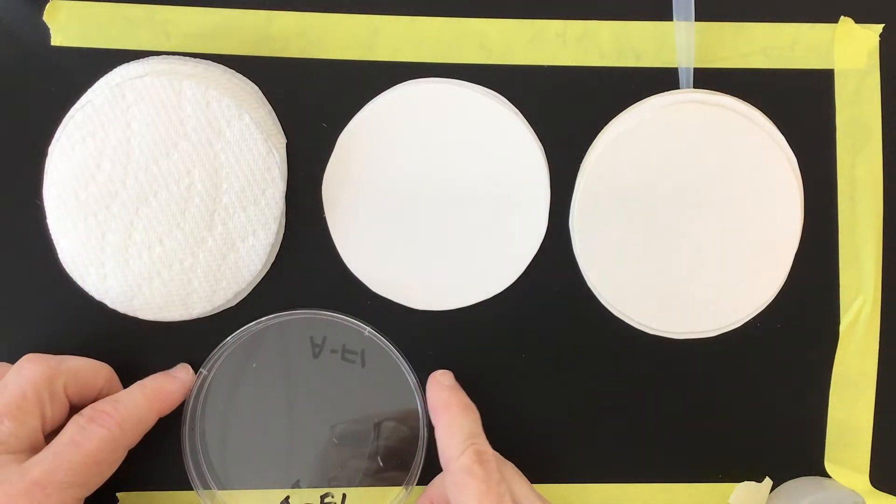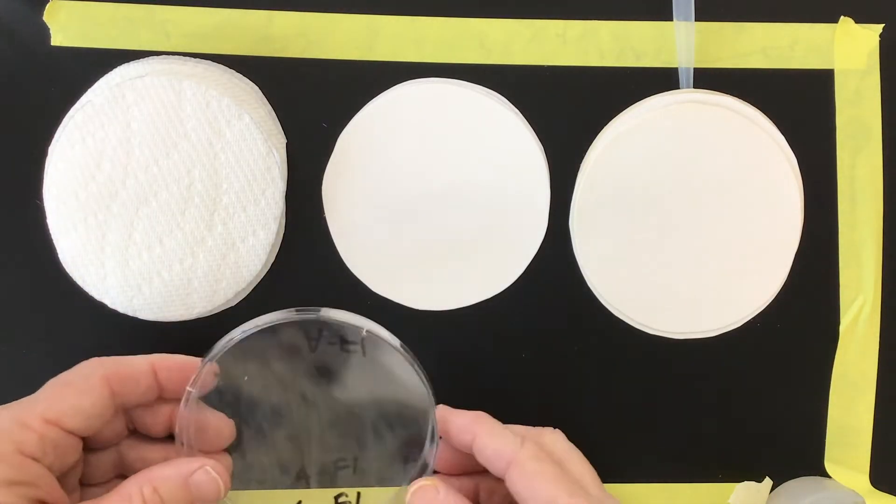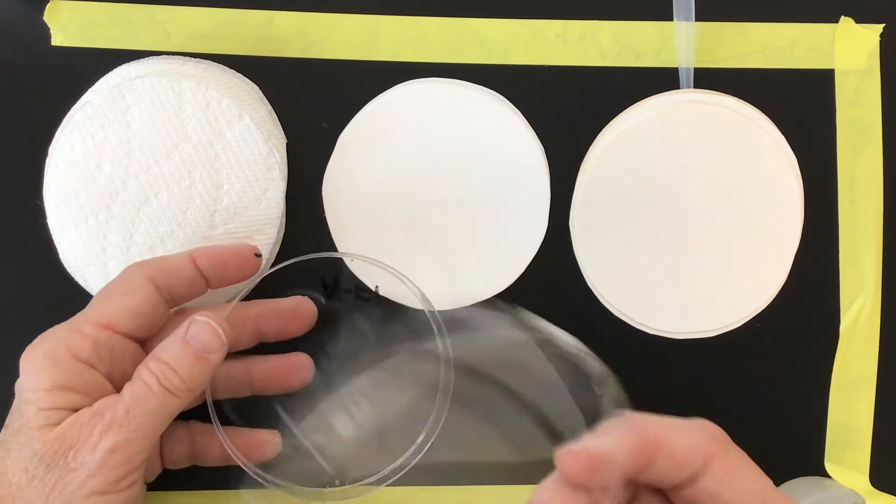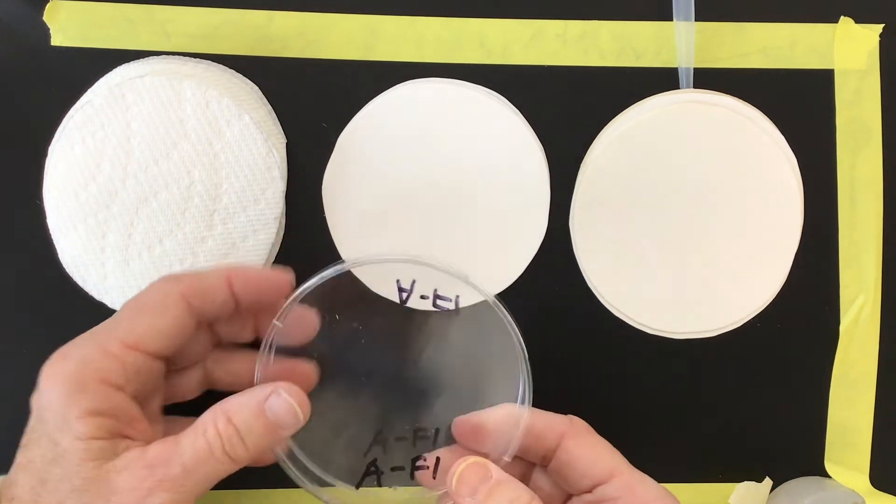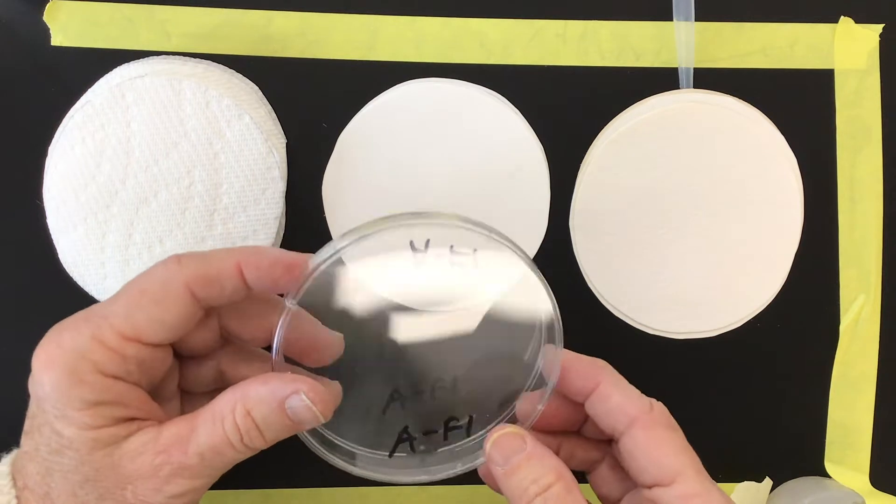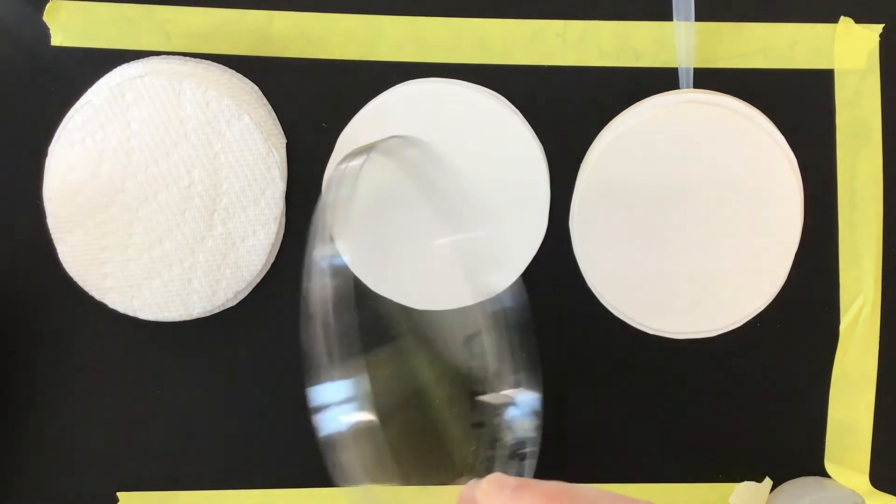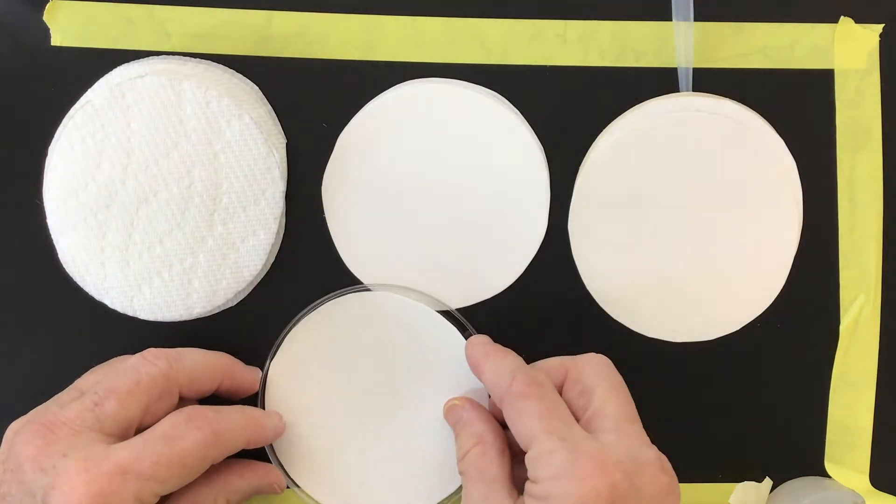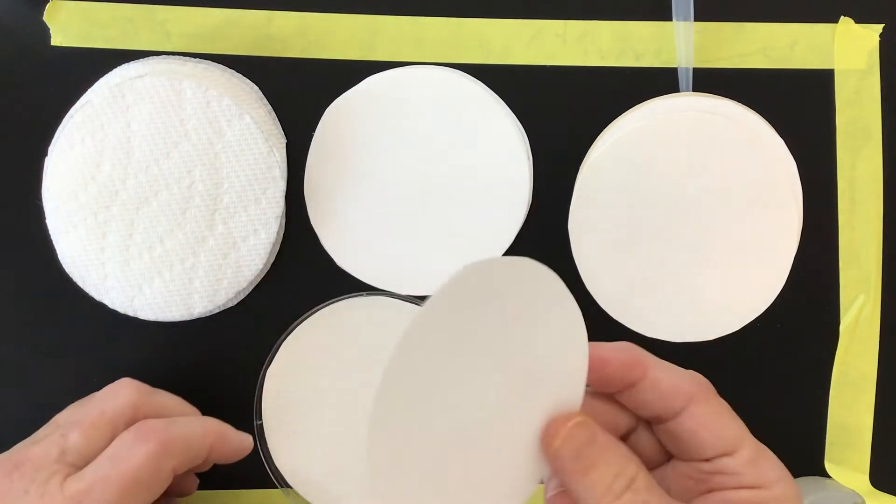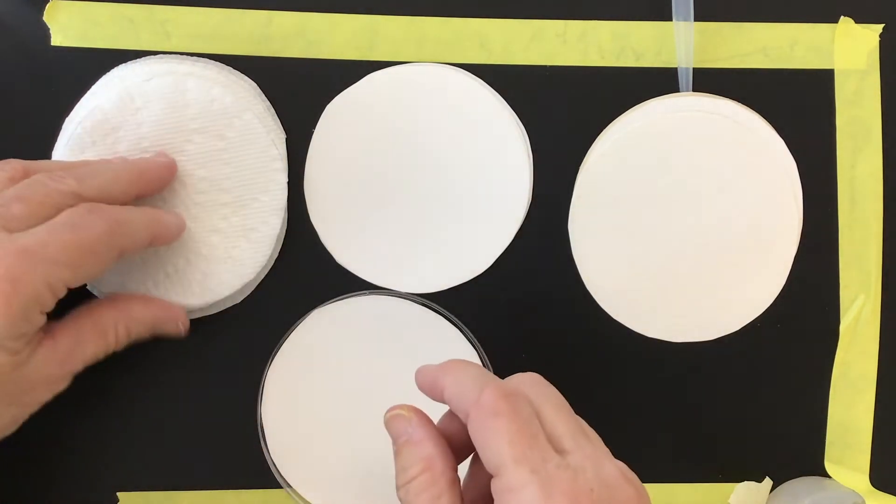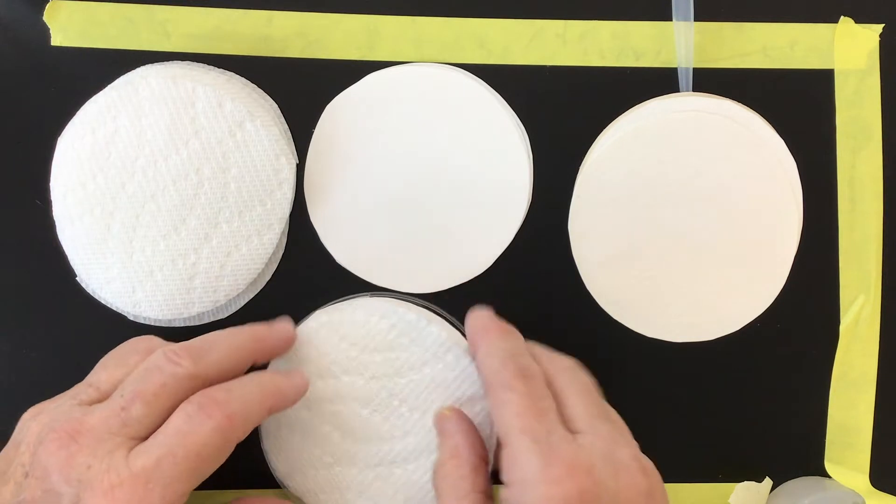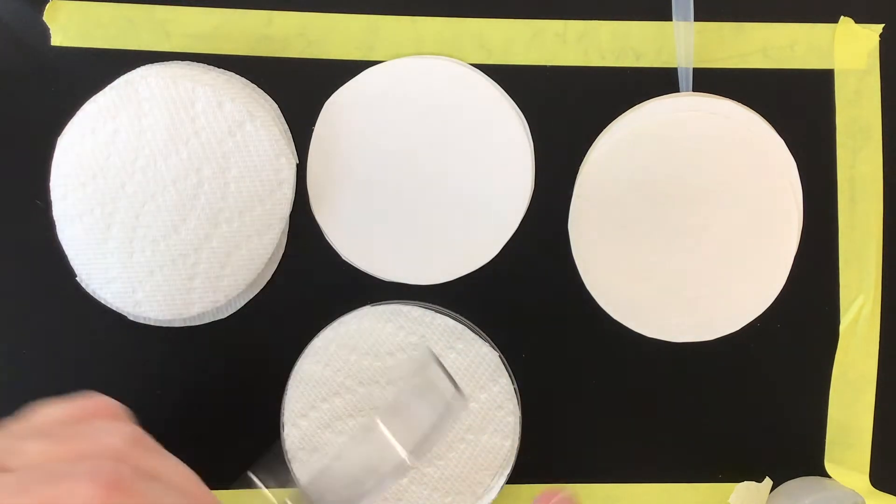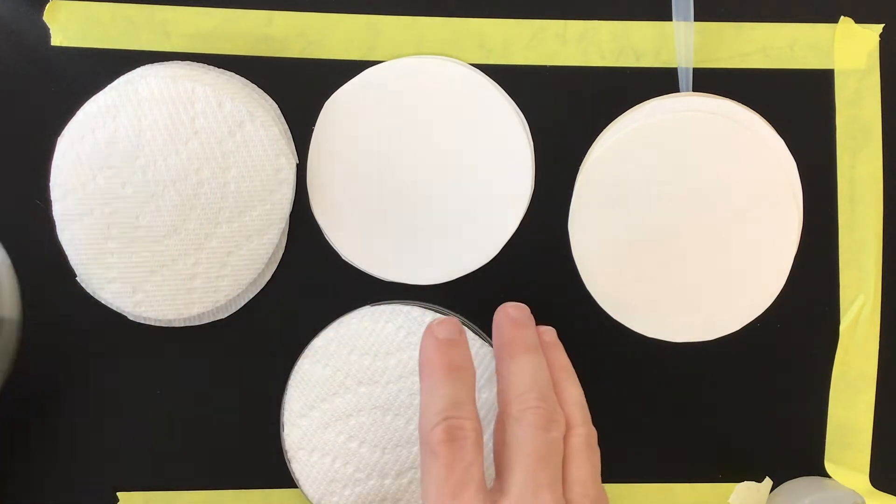The next thing we're going to do is we're going to put our filter papers into our petri dishes. The filter papers are going to go in the lid. The lid is the skinny one whose edges overhang the bottom piece. In that you're going to place one of the firm filter papers, one of the flimsy filter papers, and two of the paper towel. So do that for each of your petri dishes.